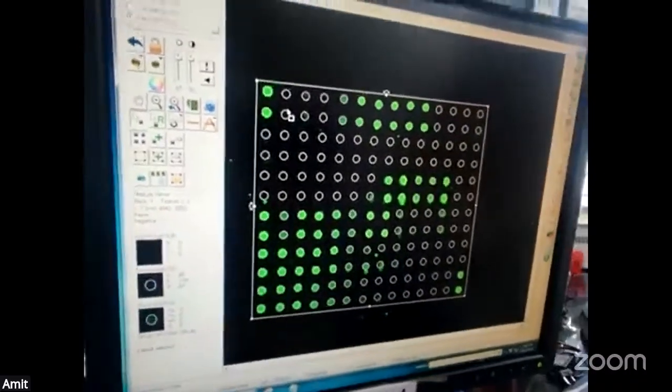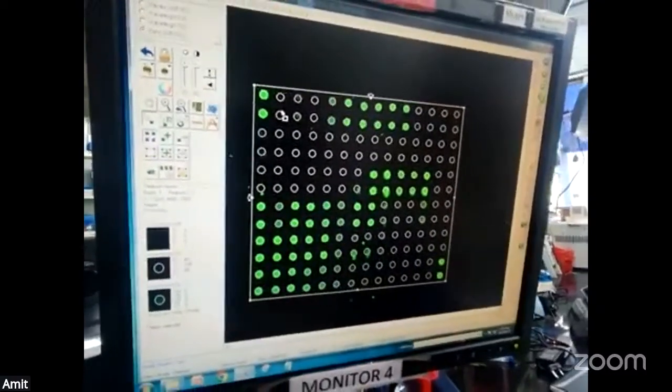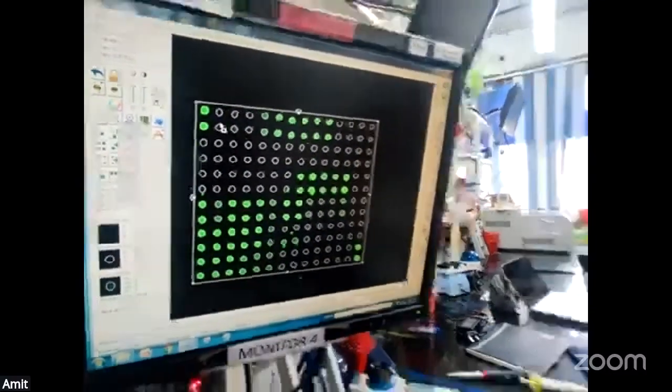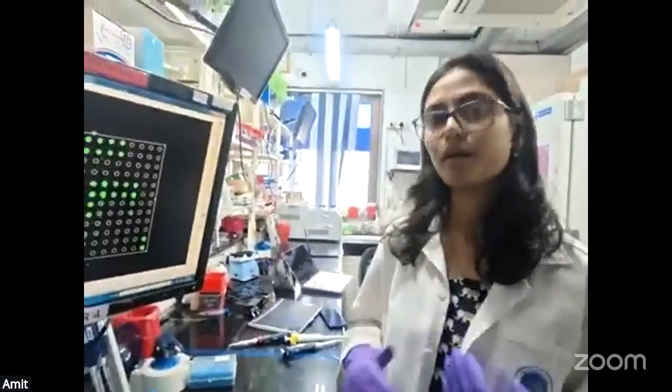Basically, we can use buffer or any compound, so it will show no fluorescence, no intensity from there. This is the first point of data check. So we can analyze from this that the data that we have are reliable.